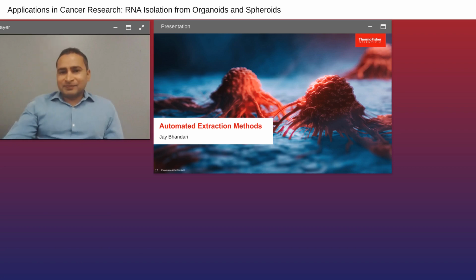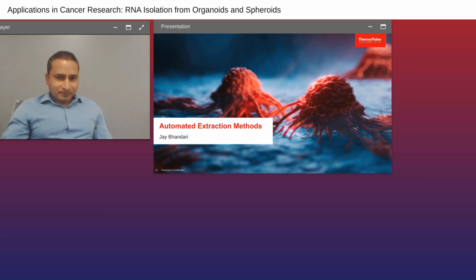Thank you, Anupriya. That was a really good intro to our gold standard methods for RNA isolation using spheroids and organoids. Again, my name is Jay Bhandari. I'm one of the application scientists here at Thermo Fisher Scientific. In the next few slides, I'll introduce some of the automated and high throughput extraction methods for these 3D cultures and present some experimental data for RNA isolation for spheroids and organoids using these methods.